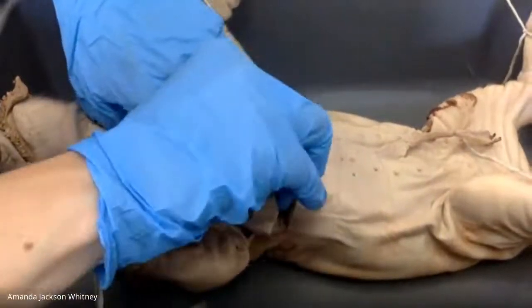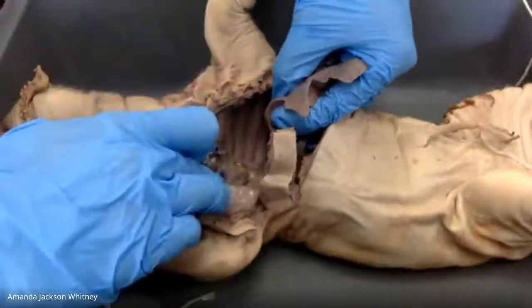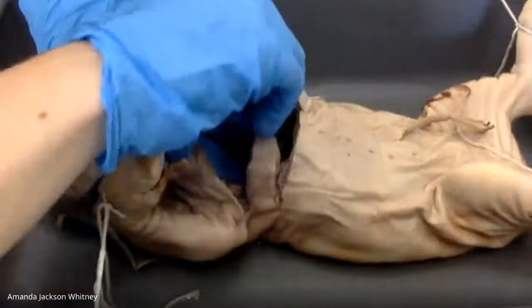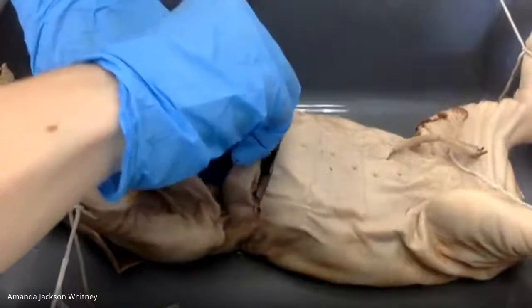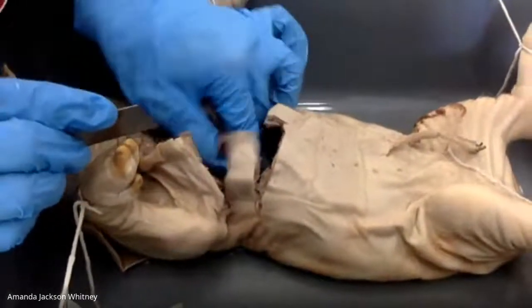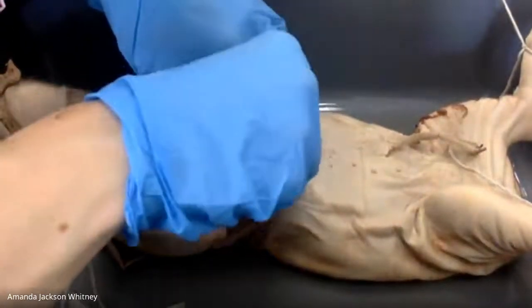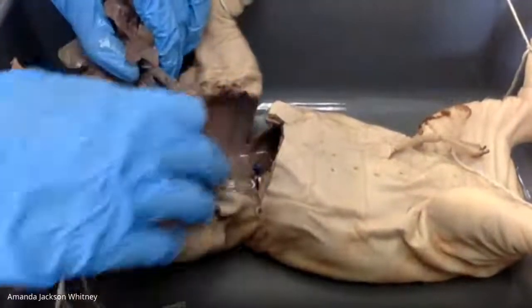Okay. Come here, lungs. Get out of there. We'll connect it just here at the very bottom. Almost there. Get out, lungs. There we go. A lot of things connected down here with the, oh, look, there's more latex.